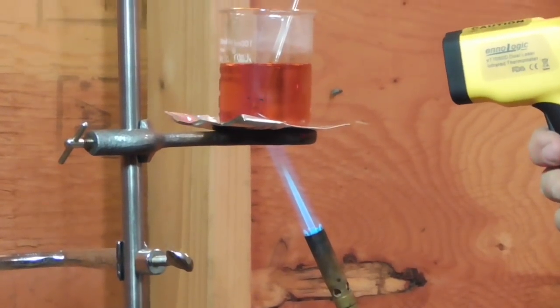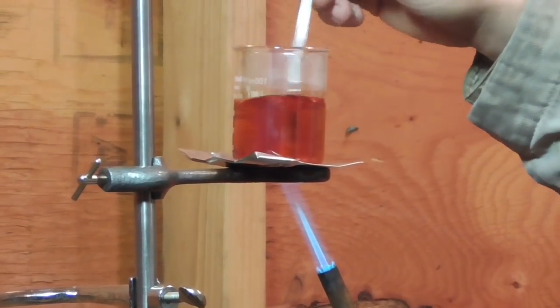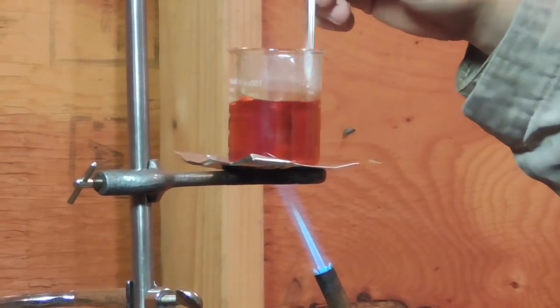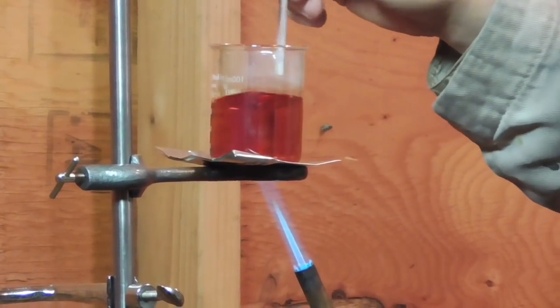We just hit 350 degrees. The oil is clearly changing color. The sulfur has mostly disappeared — the little bit that's still visible is little black flecks.